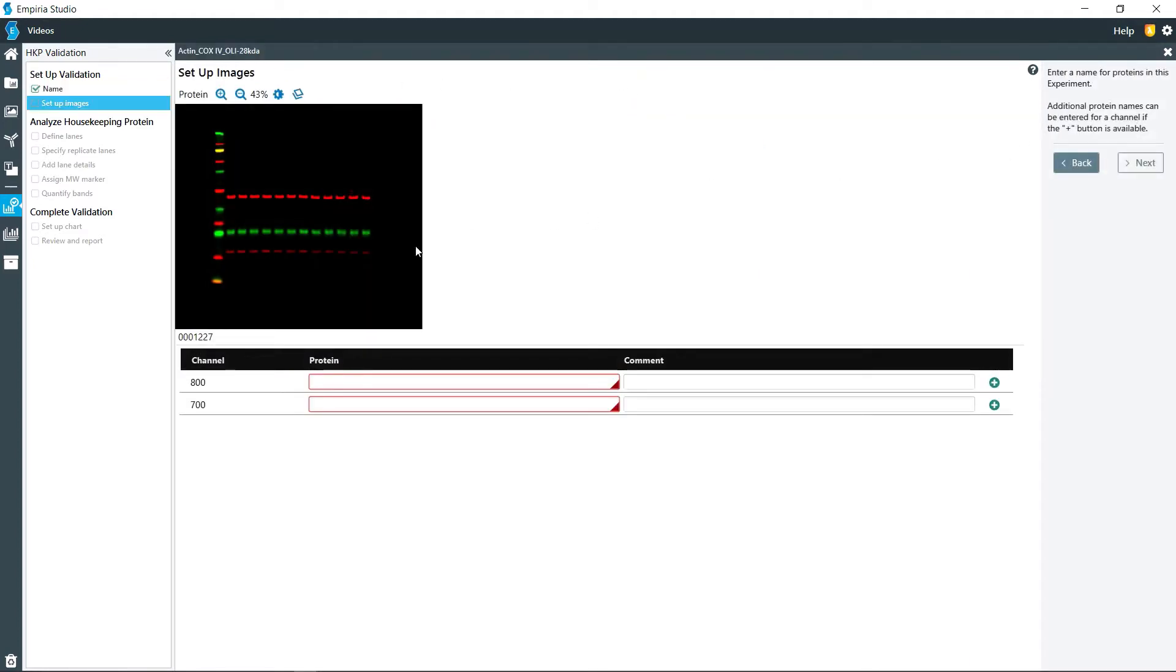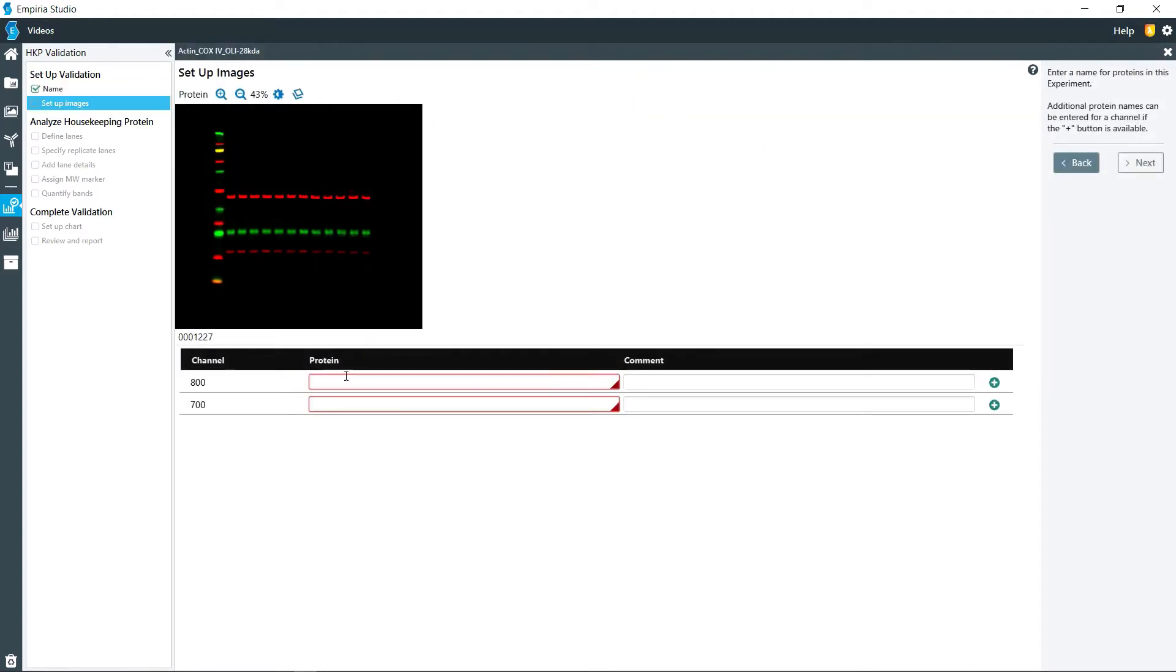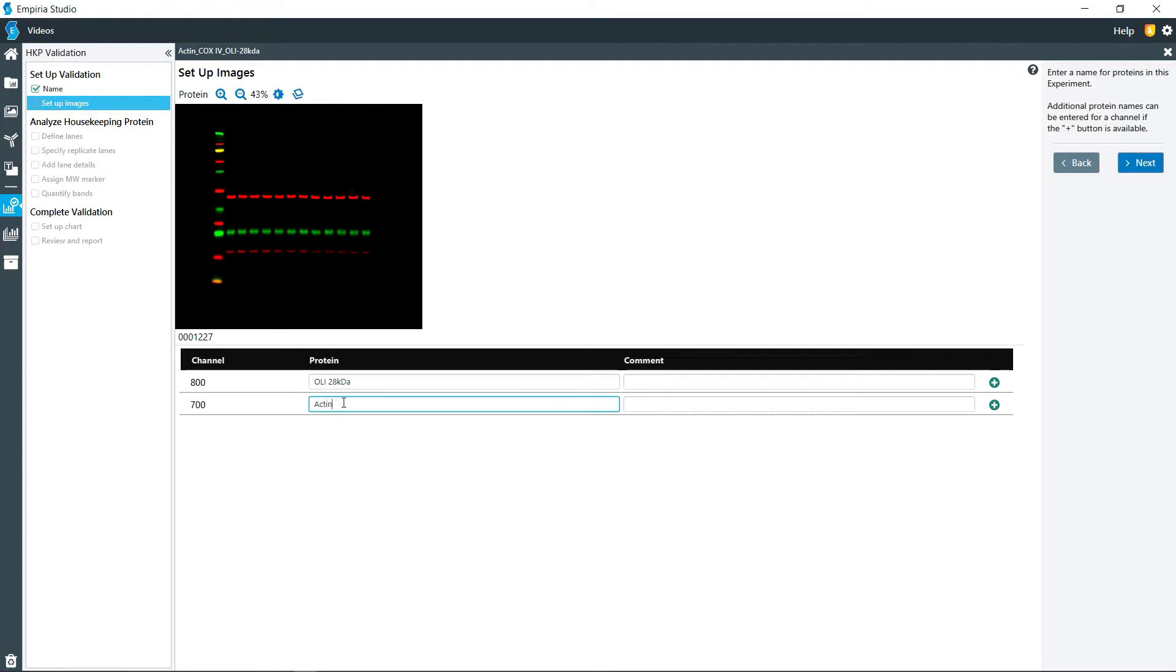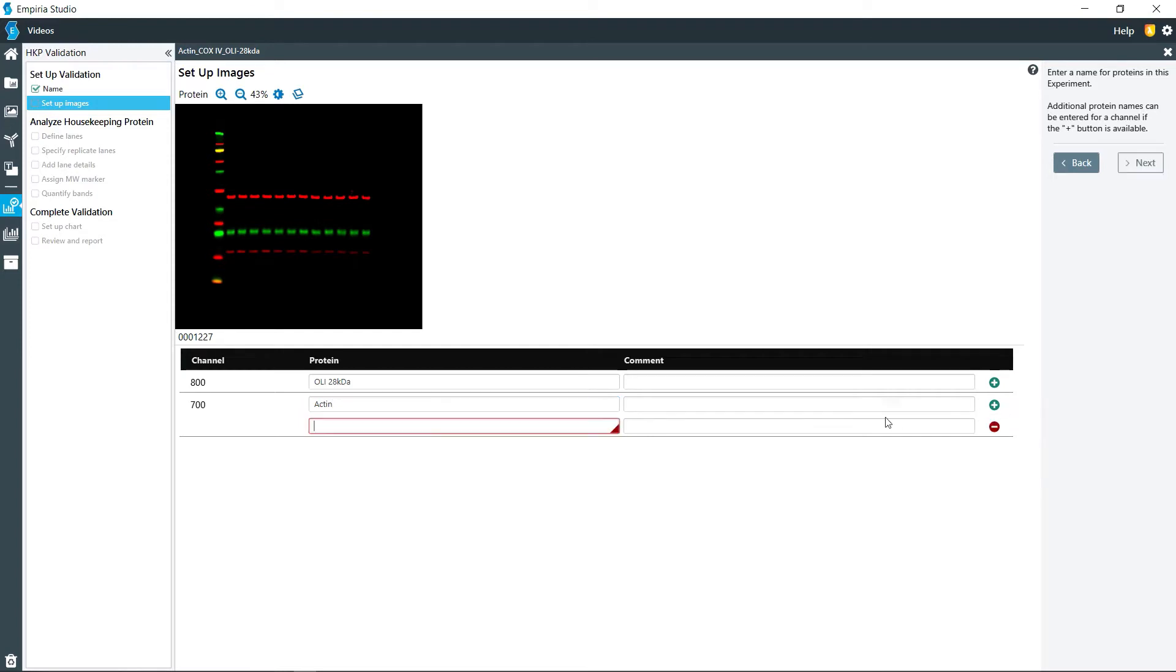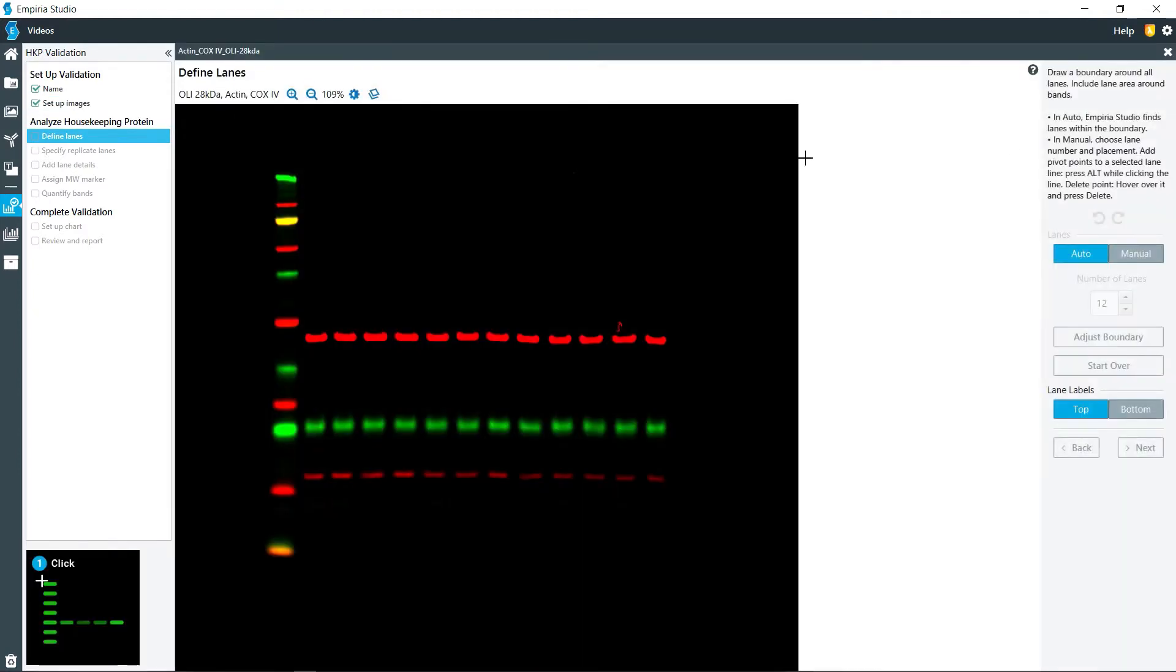Click next, and so then in the 800 channel I will save the Odyssey loading indicator at 28 kilodaltons, and then in the 700 channel I have actin. Then, since I have two proteins that I'm going to be quantifying, I click on add the protein to this channel and say COX-4. And then click next.